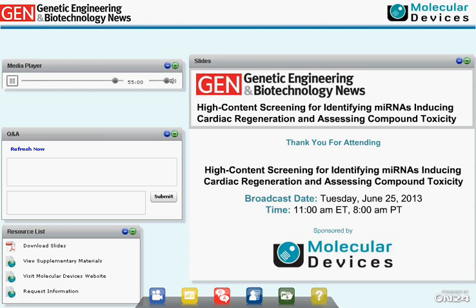All right, Vicki, here's another one. What is the typical runtime to capture an entire 96-well assay in two colors? Typically, in two colors, by capturing a single image per well, you can image an entire 96-well plate in 3 to 4 minutes.